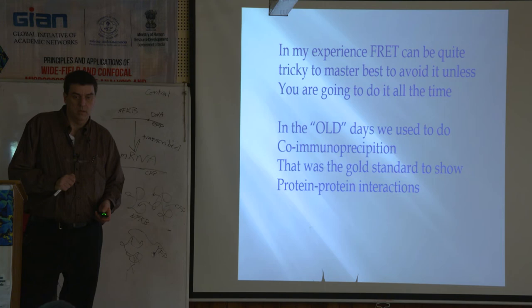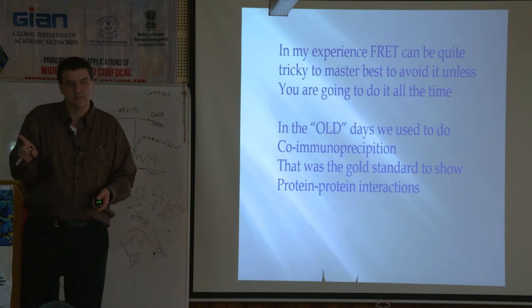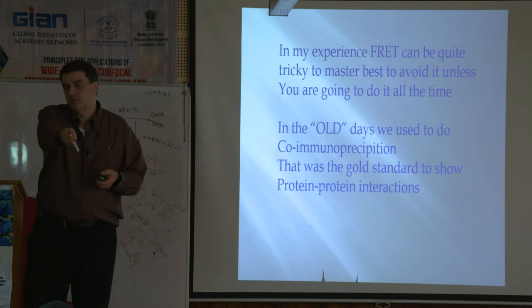Complemented by the biochemistry. Yes, exactly. Anytime in science you want to publish something, you show it one way, and then they want to see it another way. Different techniques show the same thing. So the answer would be that yes, they probably interact, but then you would do the biochemistry to say yes, they really interact.